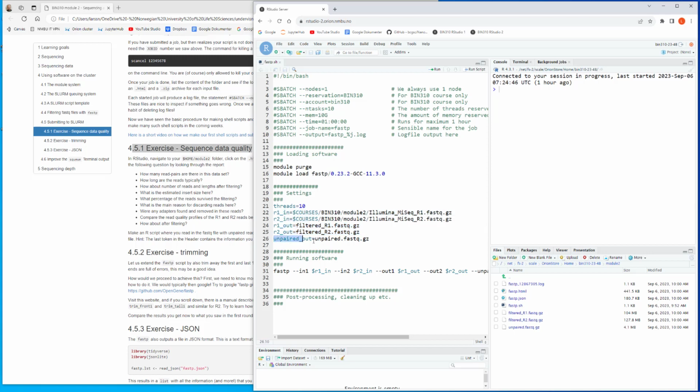And then a few reads should end up here, not too many, because if very many reads end up here, it means the quality of the input was very poor, so that many reads lost their mate, right? But this will of course vary based on the dataset itself. And here we can see these three files output now, and we can actually look at the size of them right here in terms of megabytes. So we can see that these two are like 100 megabytes, slightly bigger, while this one is only 4. This looks reasonable to me.